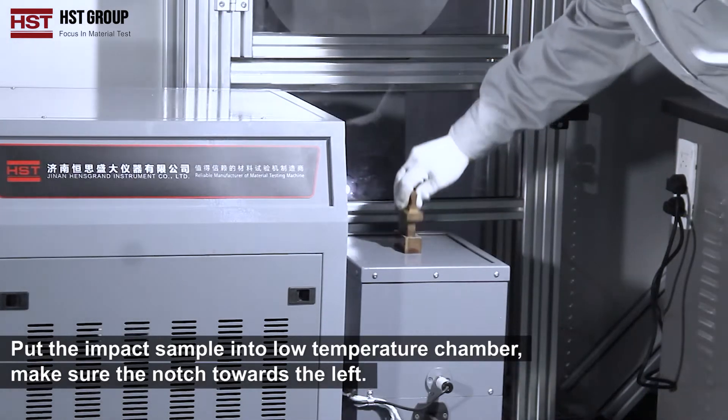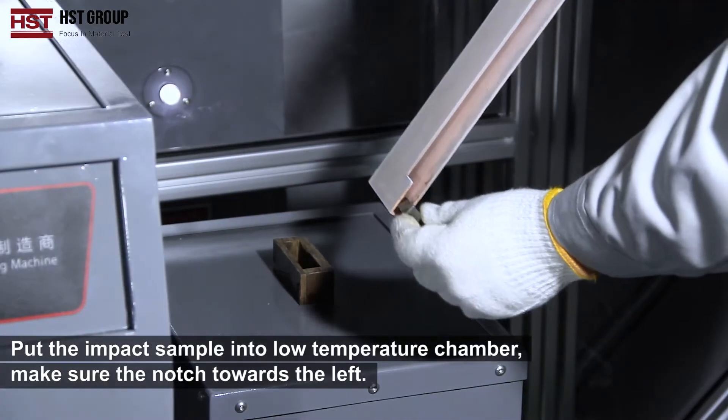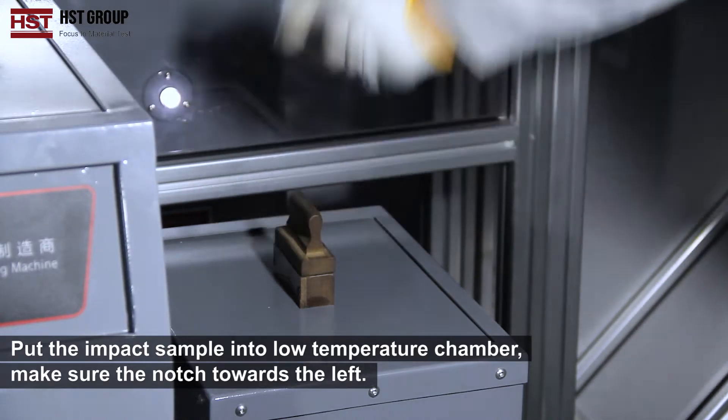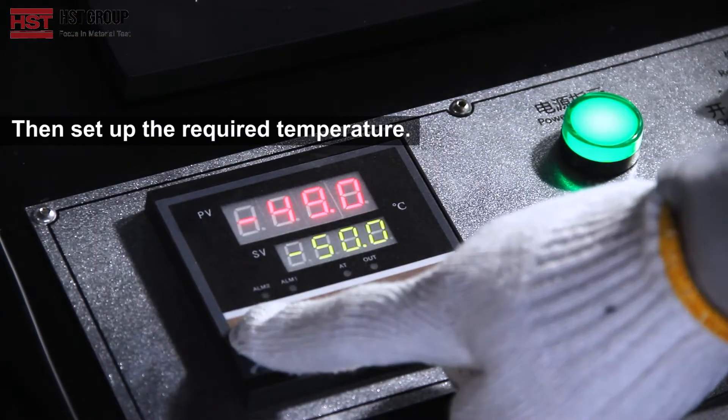Put the impact sample into the low temperature chamber, making sure the notch is facing towards the left. Then set up the required temperature.